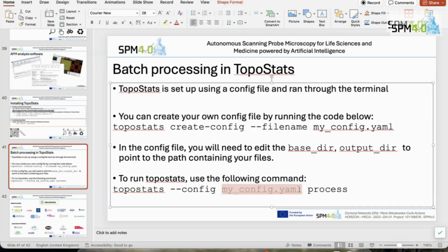Yes, I think it's. So it creates a massive image. Yeah, that's fine. Single pixel trace. And then it converts it to a slide. Yeah. So, yeah, that's all. In the future, that role should have done a similar thing, yes. But what you might have to do is change the parameters depending on what you're processing and what you're looking at.